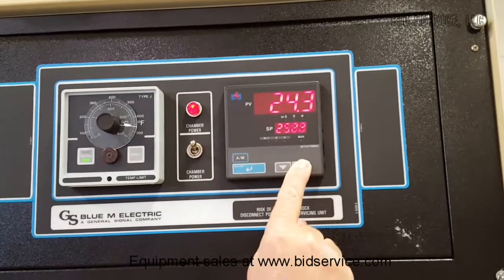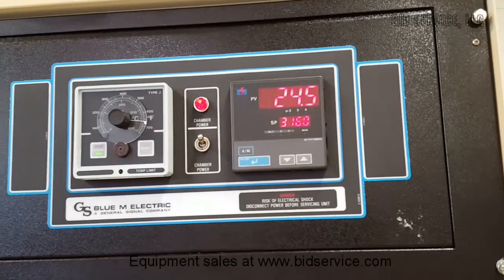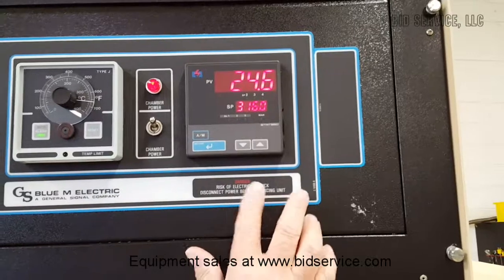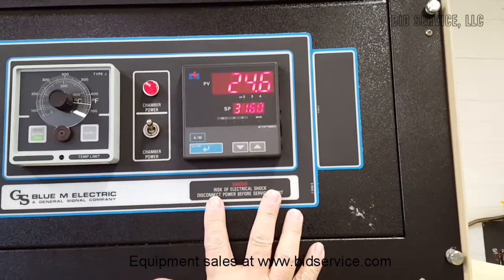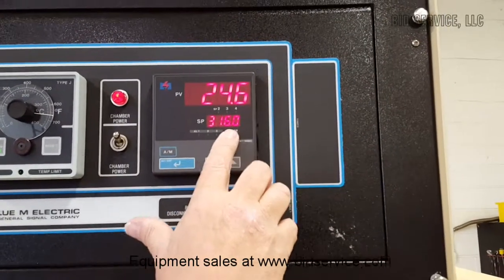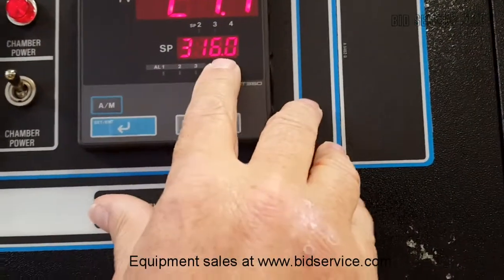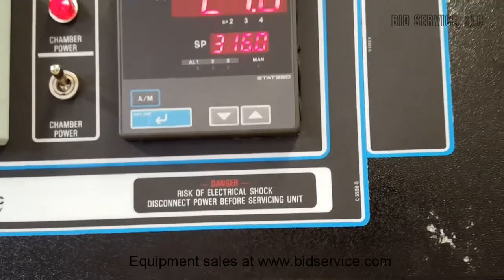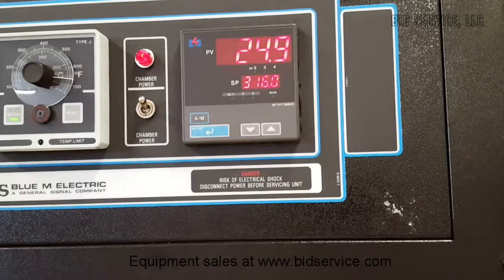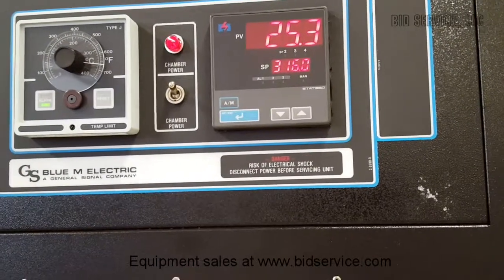It has basic PID parameters entered. These may need to be adjusted depending upon your application. You can see I have it set for maximum — the maximum it can go to is 316. There should be a flashing period here; when I hit Enter, that period will go solid. That's the indication that it's accepted the number you've put in. Otherwise, after 15 seconds, it would time out and go back to what it was before.